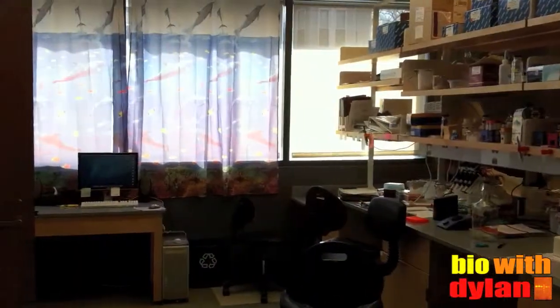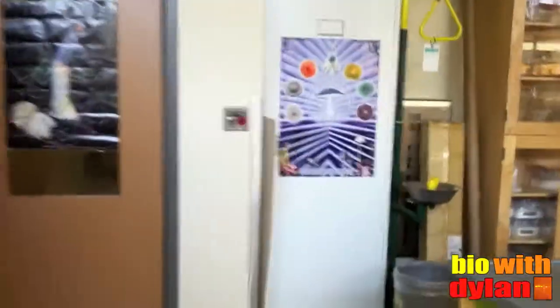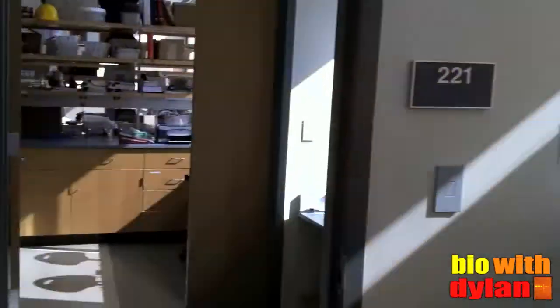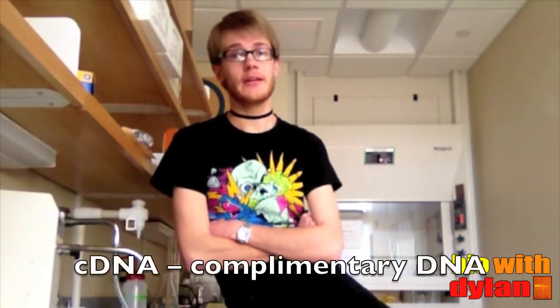To avoid contamination from work that I've already done in my lab, I've been doing work in a lab just down the hall. This is the bench where I've been setting up my reactions. The difference between one-step PCR and what I've been doing previously is that both the cDNA synthesis and the amplification are done in one step, as opposed to making the cDNA first.